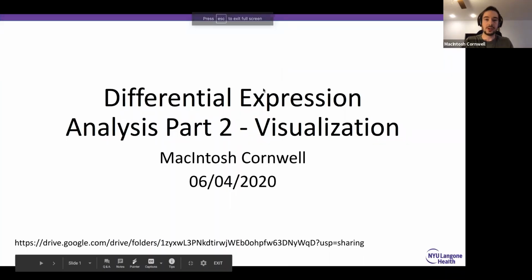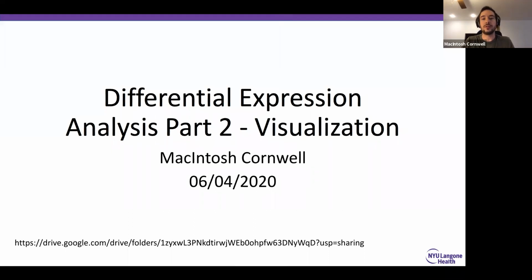Through the first lecture, we spent our time working through what differential expression is and how to run through some basic analysis using DE-seq2. Today, we're really going to focus on the visualization of the analysis. We wanted to spend a whole lecture on visualization because in the end, your data is useless unless you can properly display what it actually means. And there are lots of different ways you can visualize this analysis depending on the message that you're trying to send.